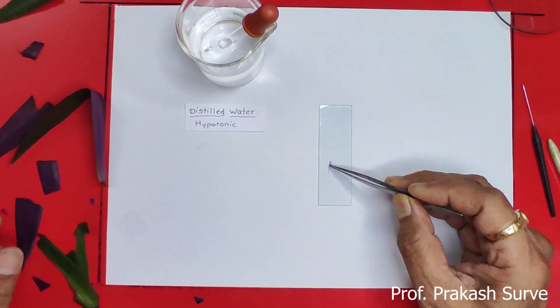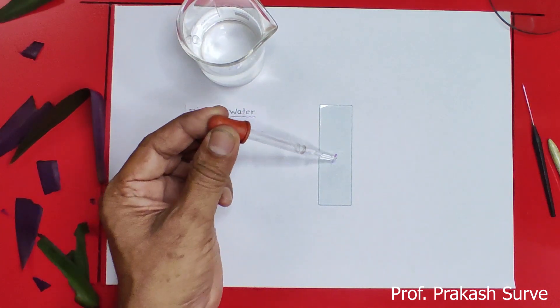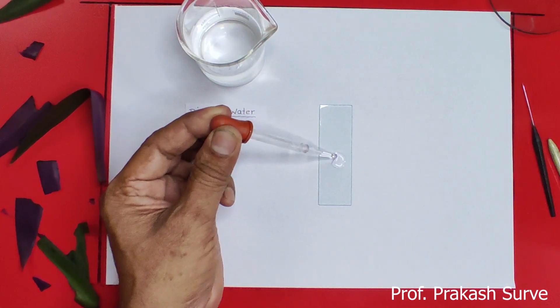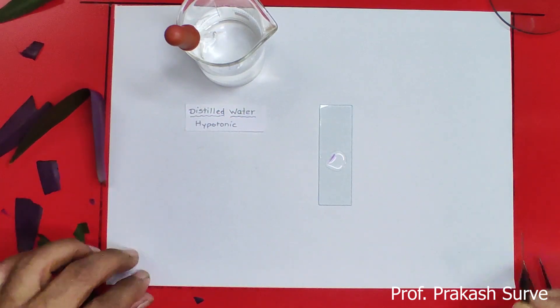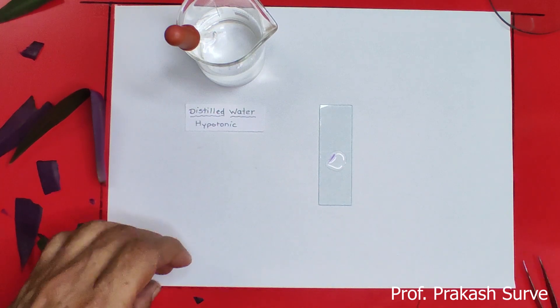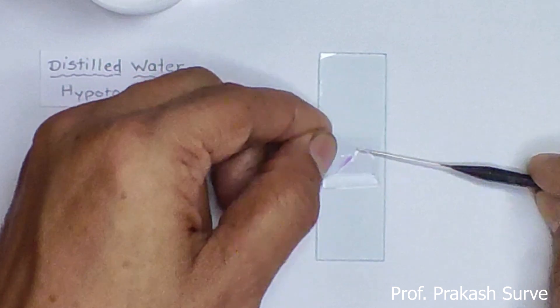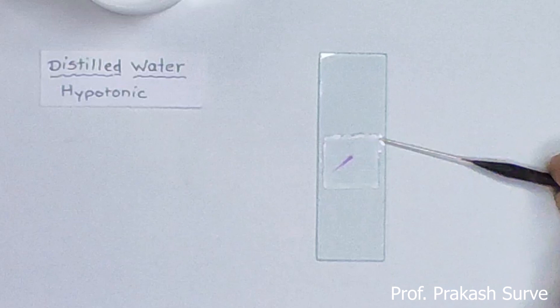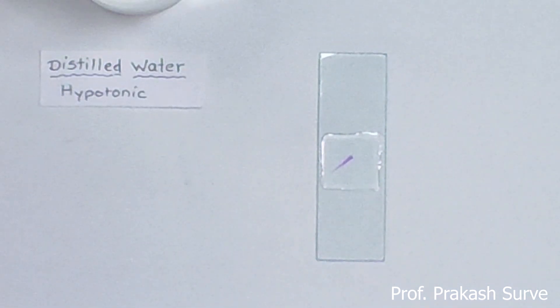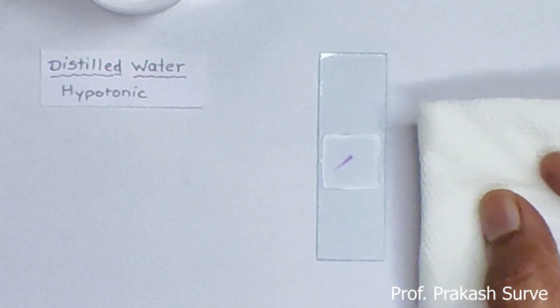We'll keep this in the center of the slide and put a drop of distilled water, which is a hypotonic solution, on it. Slowly put the cover slip — first touch it to the water, then from the lower side keep the needle and slowly release the cover slip so that there will be no air bubble. Excess water is removed with the help of filter paper so that the slide is neat and clean.